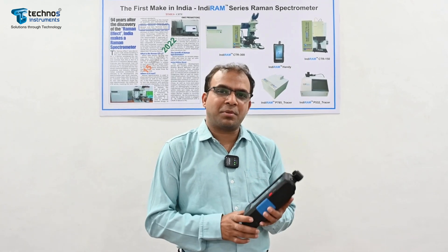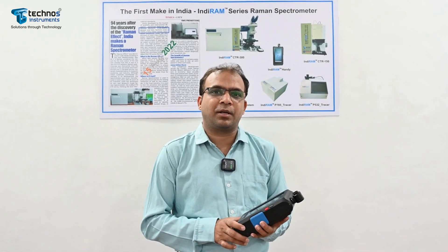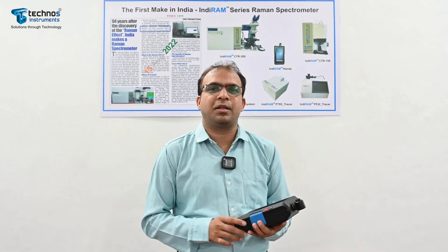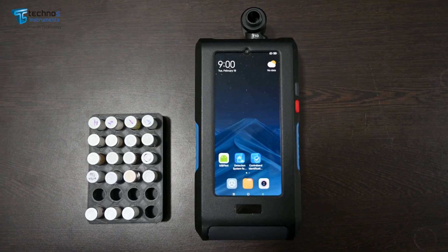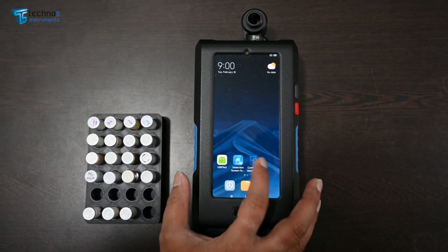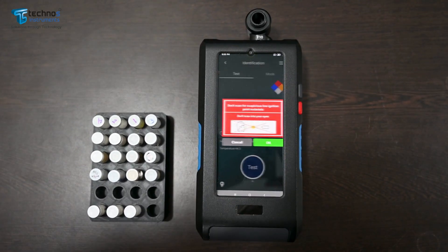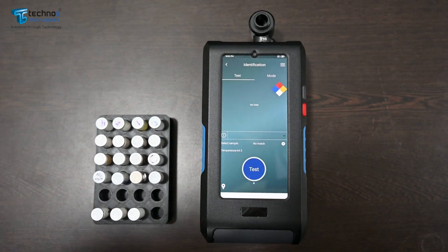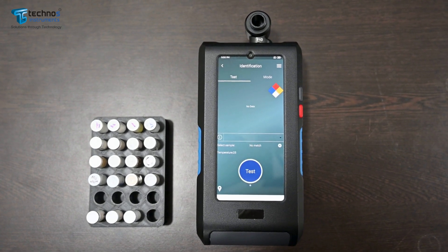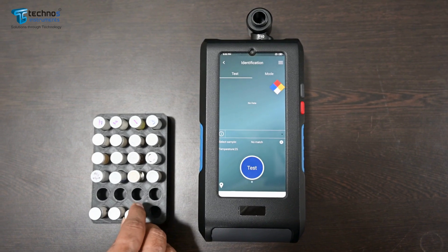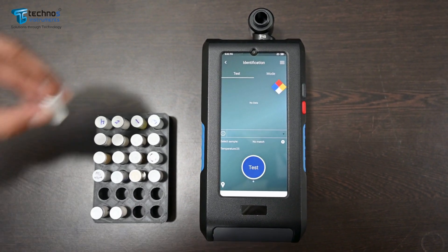Let's see how this palm-sized IndiRAM handheld Raman spectrometer can be used to identify these excipients accurately. We will try to identify all three excipients, starting first with Stearic Acid.